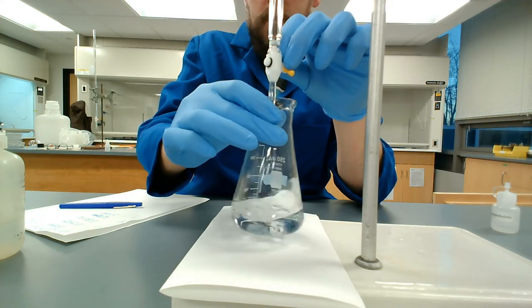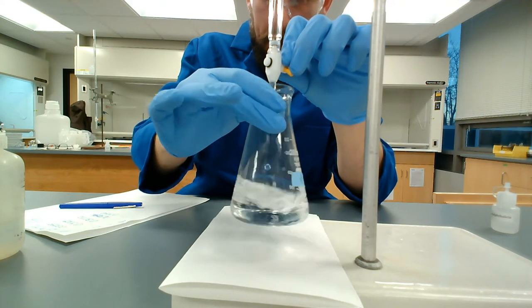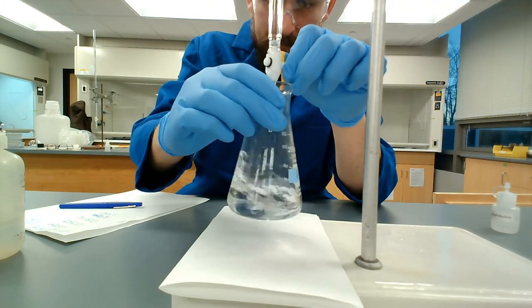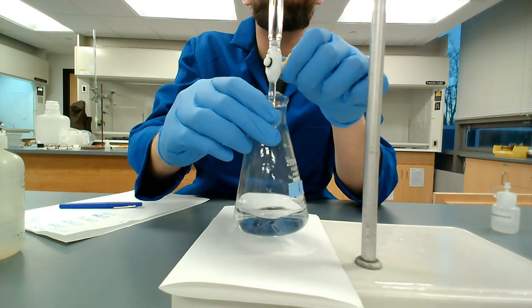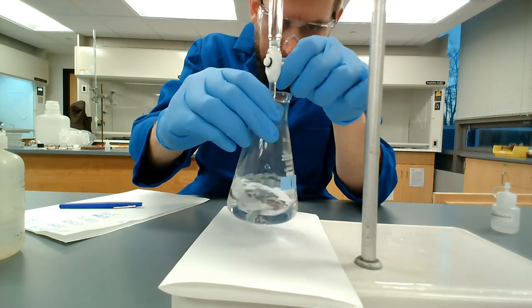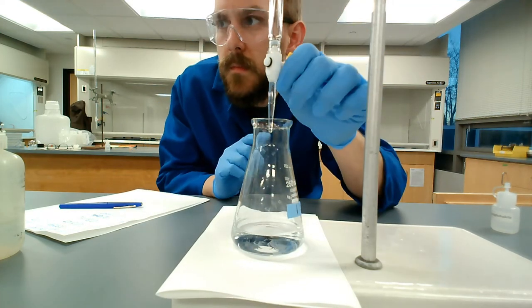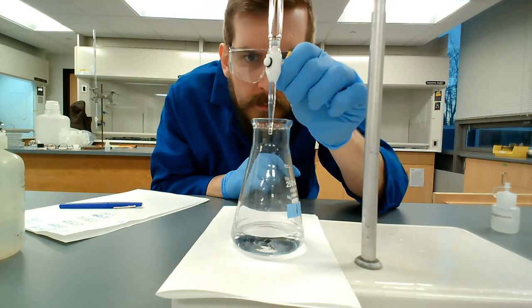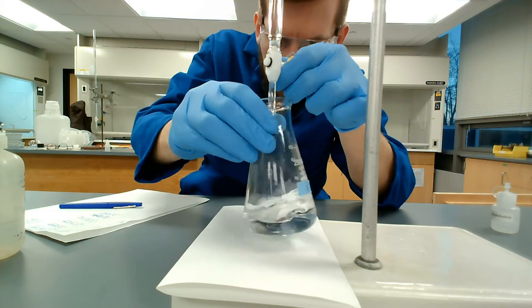Both hands are involved in the titration. One is actively stirring the flask. The other one is opening and closing the burette stopcock to different degrees to let in fewer drops or more drops over a period of time. So I open this up a bit. I'm swirling as I'm doing this. I'm going to try to get it to go a little bit slower because I think I'm getting close to the endpoint. So I'm doing maybe two drops a second here.